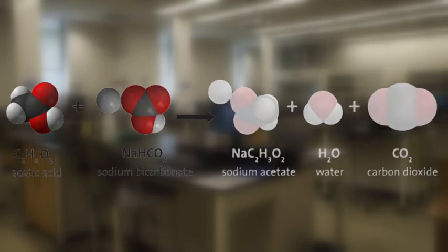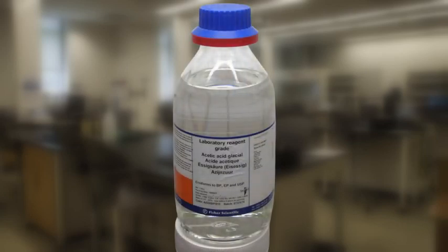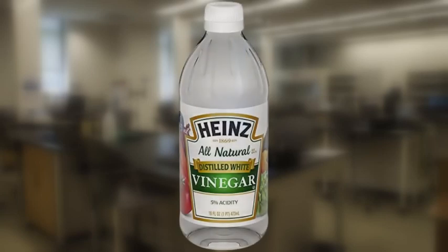If so, how? A little tidbit, I had no idea acetic acid was found in vinegar and was the main ingredient. Acetic acid, for your information, can be used in the synthesis of numerous drugs, while it is usually in its dehydrated form, acetic anhydride, but still. It does make sense. Vinegar is easy to make, and in turn acetic acid, so it would be perfect for drugs, a cheap and easily producible chemical.